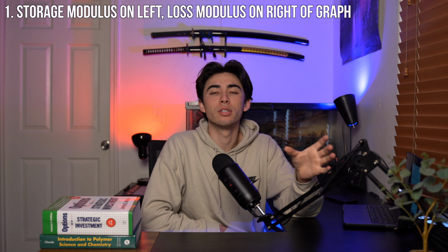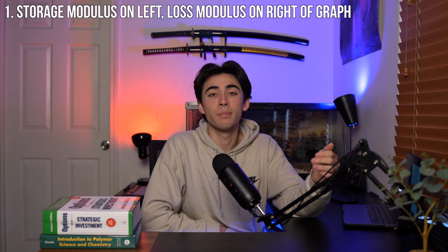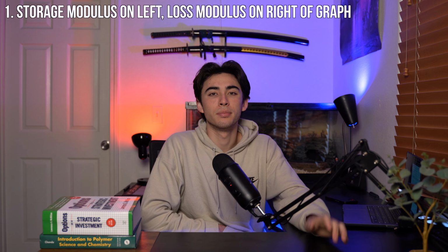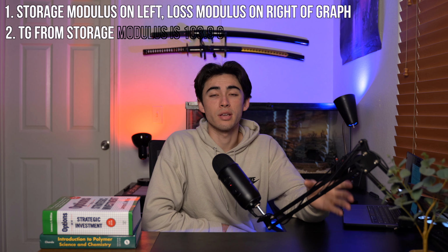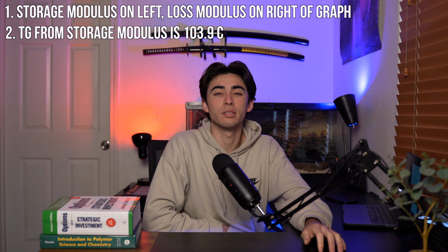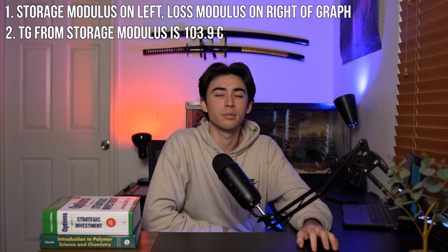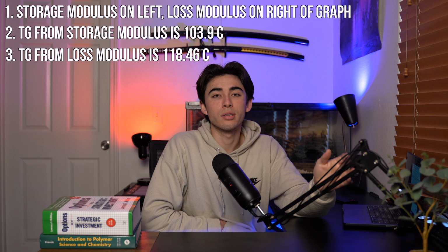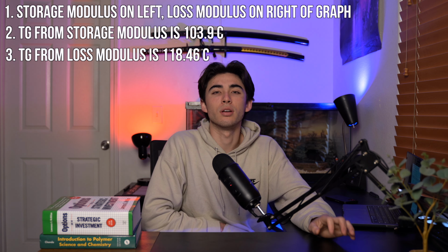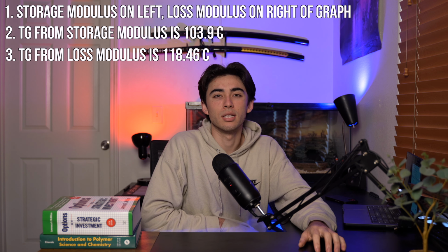For question 1, the storage modulus should be on the left side of the graph, also represented by the green, and the loss modulus should be on the right side of the graph, represented by the blue. For question 2, we can see that the step change for the storage modulus is at 103.9 degrees Celsius. Thus, that is the glass transition temperature using storage modulus. For question 3, according to the loss modulus, if we look at the absolute maximum, the glass transition temperature of this PET sample would be 118.46 degrees Celsius.